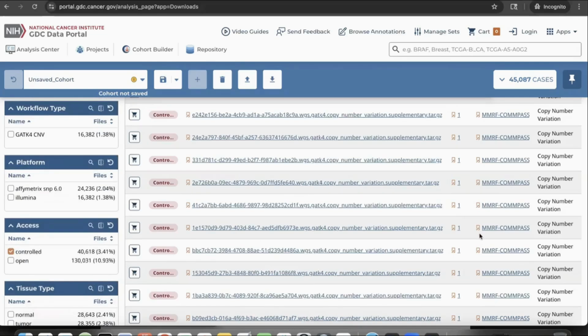Next question, can the visualization tool be used on our own data? The GDC does not offer that yet, but I'll open that up to Shin. Is that something that's through St. Jude or something someone could do? Yeah, that's a good point. It depends. I think it's definitely useful in some cases. Users may want to bring in their own data to have it compared against the GDC data, shown side by side. We may have some convenient features, such as a simple UI where people copy and paste their copy number data in the current locus and compare it against the GDC data. That's possible. Yeah.